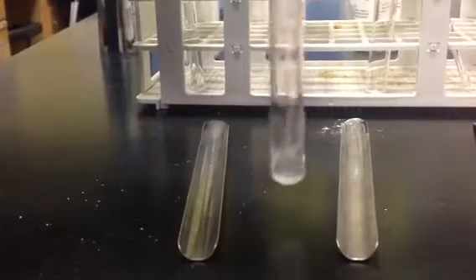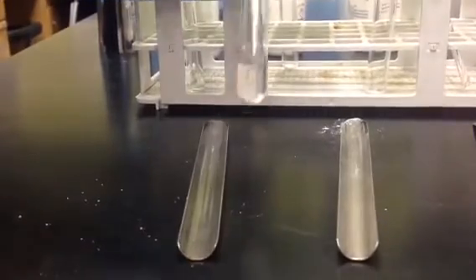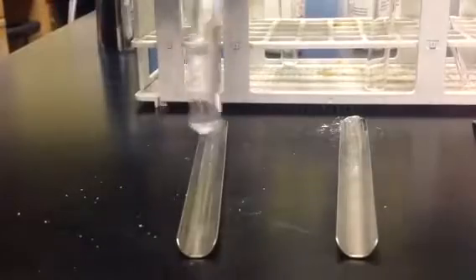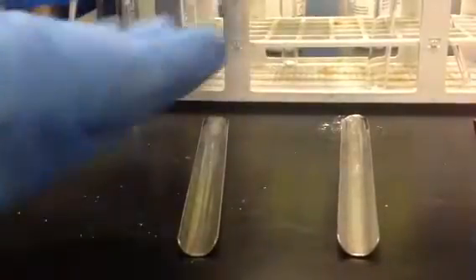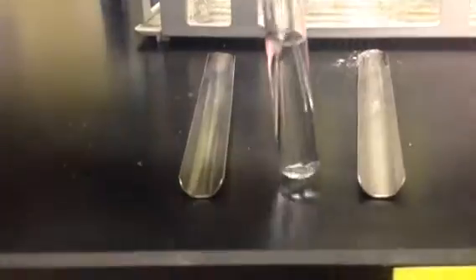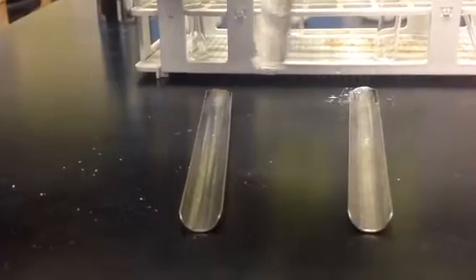I'm not using the same stirring rod. I can't contaminate, so notice that I have individual stirring rods for each solid. Add another dropper full. Again, stir. And I don't know if you can see, but that is dissolved. There is no more solid in there.